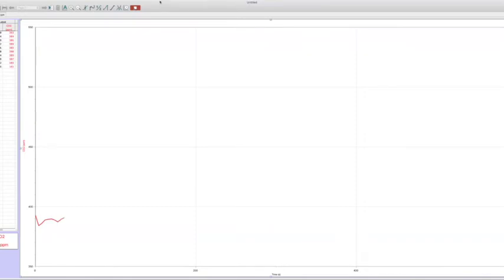Now for the computer, I'm going to stop it and then restart it after 3 minutes so you don't have to wait. You just watch the line go.